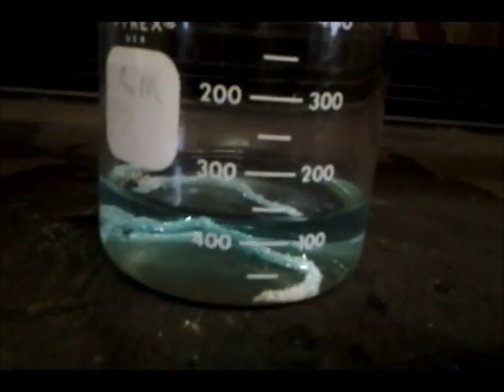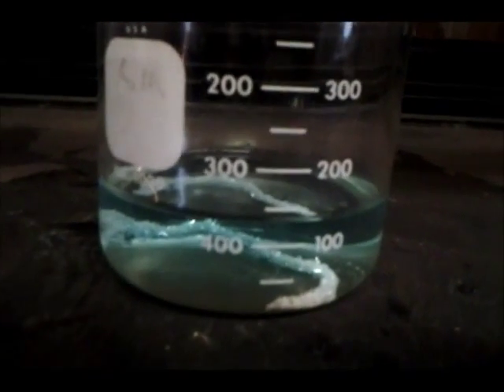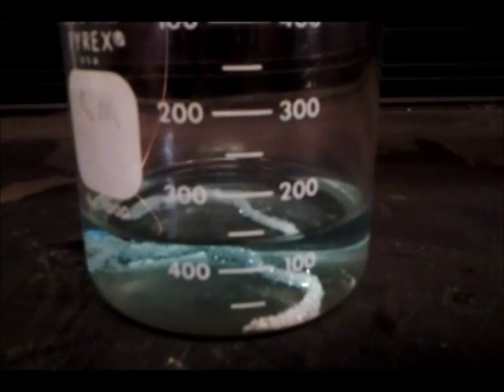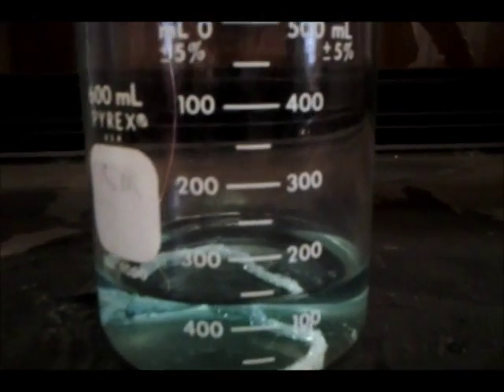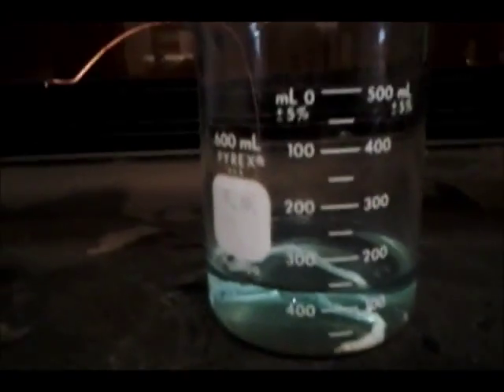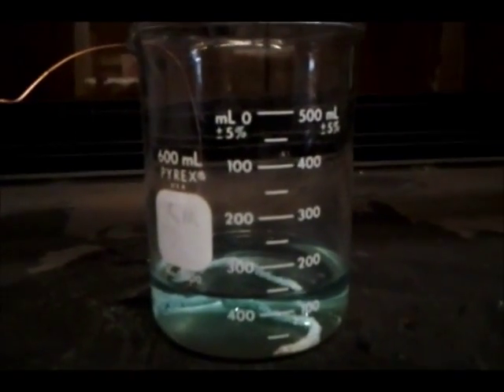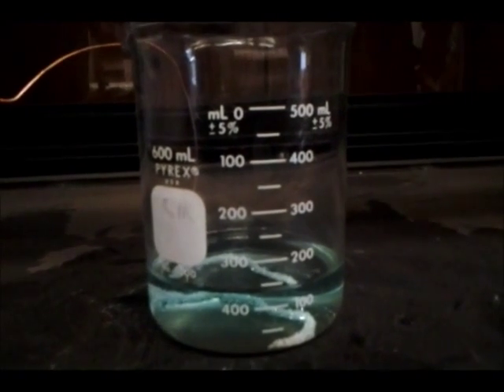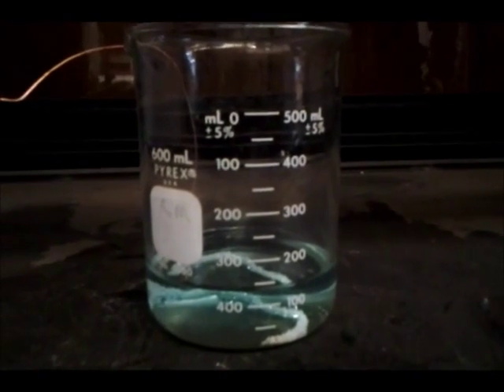As you can see, it's no longer attached. Also, the solution is also a bluish-greenish color. And yeah, this is how to get silver nitrate and copper into copper nitrate and silver. See ya.